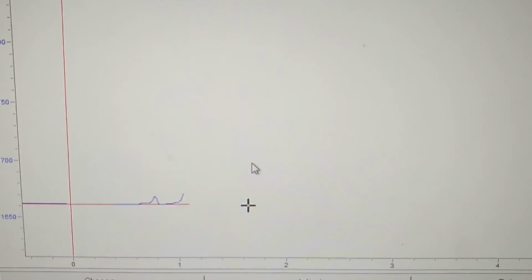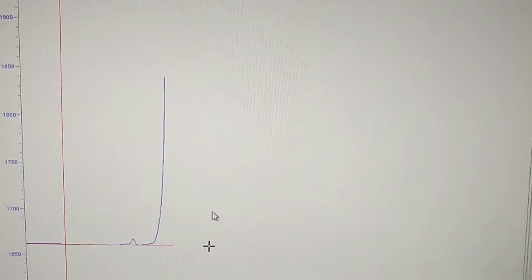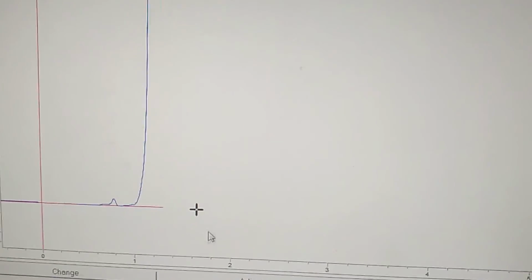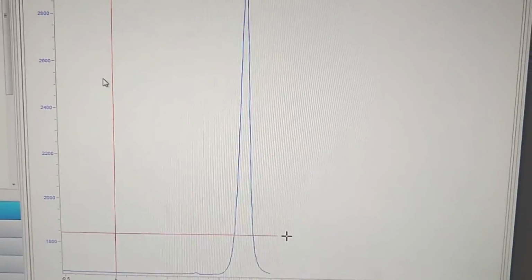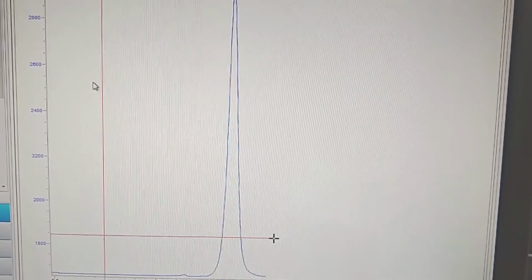And so you can imagine some packed caffeine is just coming off the column now, and now we're getting to the main bulk of that caffeine elution. So we have a really large peak here. And here, let me rescale it. And we can see this peak form. And now the peak's going back down, so just the last of the caffeine is getting off our column. And we have a really nice clean peak for caffeine here. And we would repeat this for all of our different calibration standards and concentrations, as well as our samples.